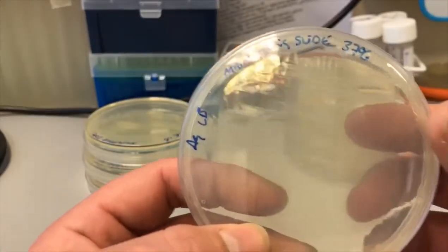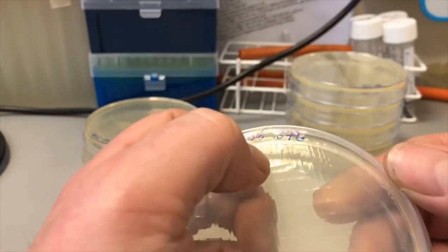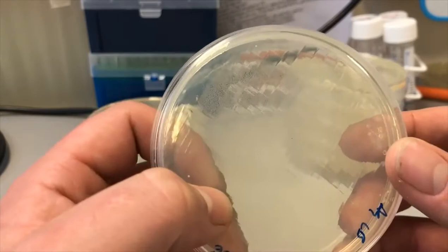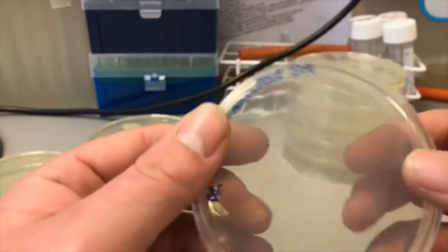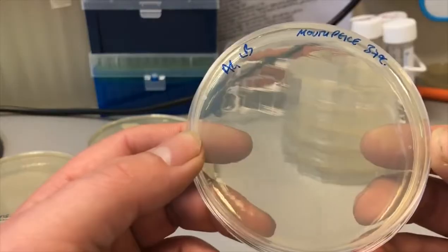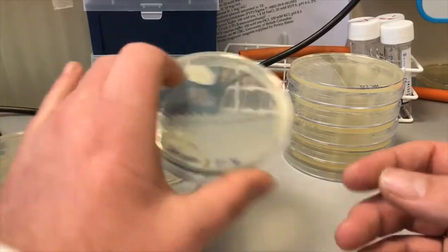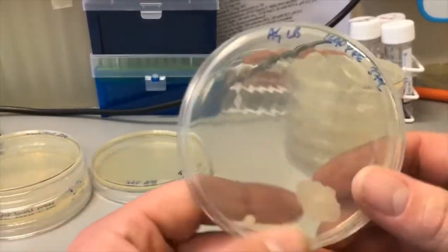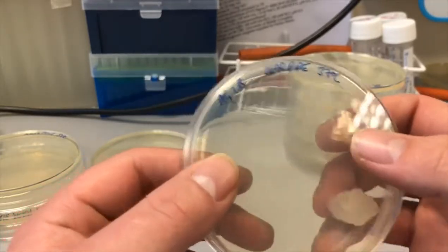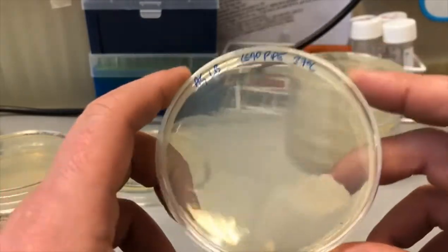Here we have the main tuning slide from the incubator — there's probably one colony up here and another one there, so we are growing stuff, it may just take a little bit longer. On the mouthpiece, to be honest, it was relatively clean. But here is the lead pipe — as you can see, we've got something really big going on there, and something big there too. There are also a couple of little colonies. The lead pipe has definitely got more growth than the other plates. The one from the bell hasn't really grown anything.